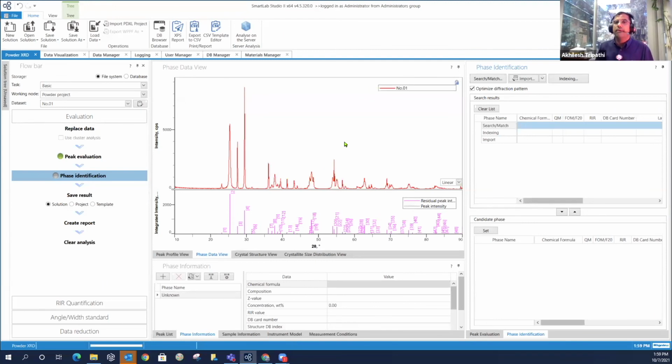Okay, thank you. What is preferred orientation, and how does it affect quantitative analysis? We all studied today in the lectures about collecting a pattern such as what is shown here, but some materials tend to have preferred orientation, for example fiber-like material or some clays, which are also part of ceramics. In these materials, certain peaks are a lot taller than they should be because the material tends to lie on certain planes.